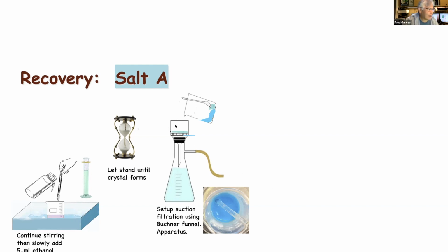We have a glass frit. It's like a funnel with a filter, except the filter paper is sort of a porous solid. And then we can filter out the crystals that we have and let the liquid with all the other contaminants or the excess residue filter through. And this is what it looks like from a headshot right here.